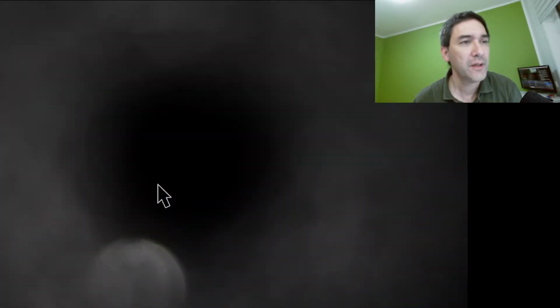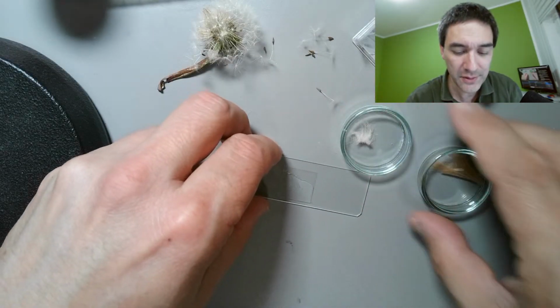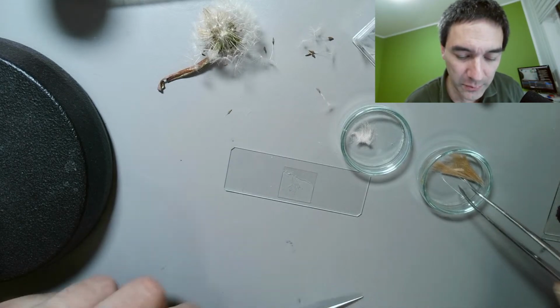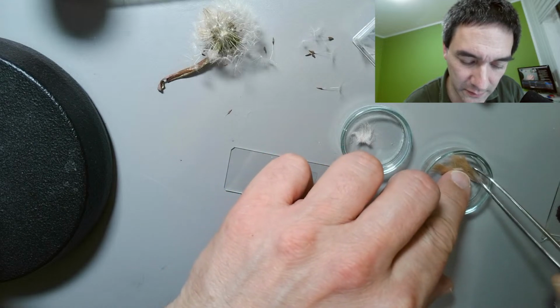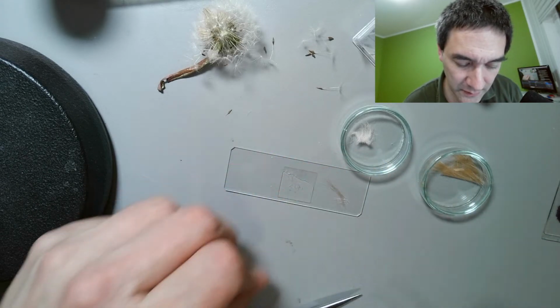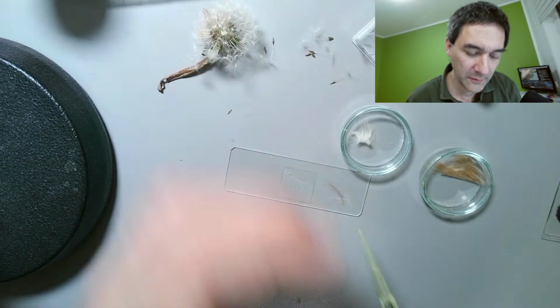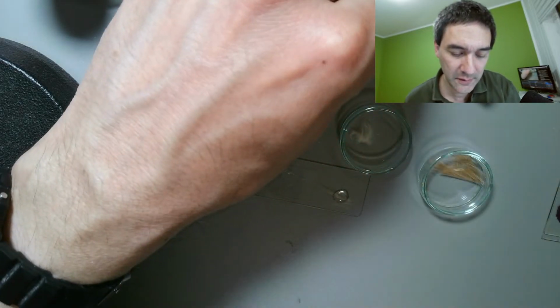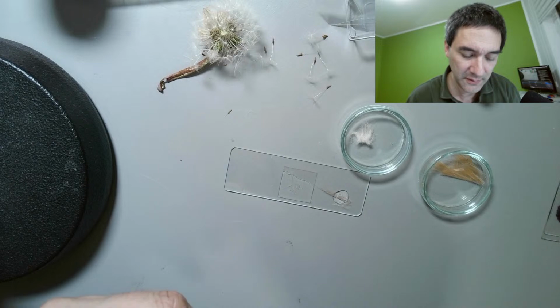As promised, today's live stream is a little bit random, going all over the place with different topics. And let's try to put a little bit of dog here now. A small amount is enough. Actually, I'm kind of surprised it takes water better than I expected.